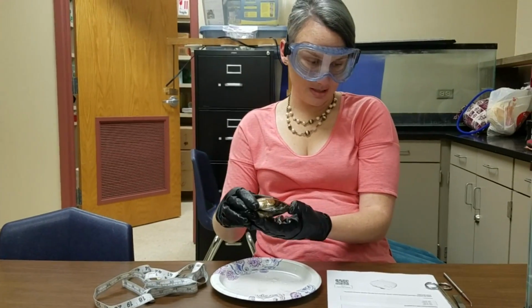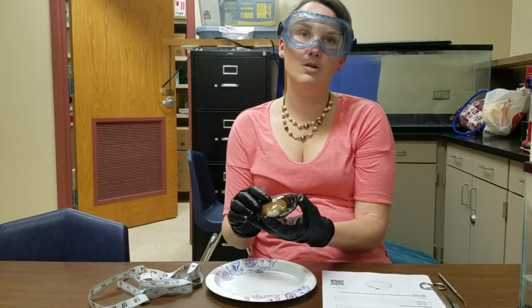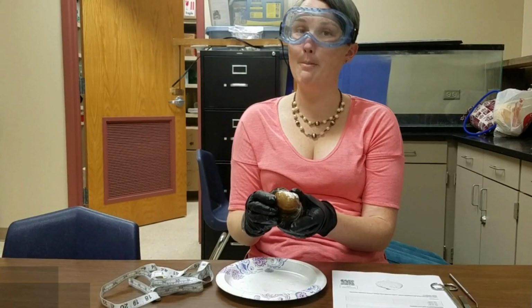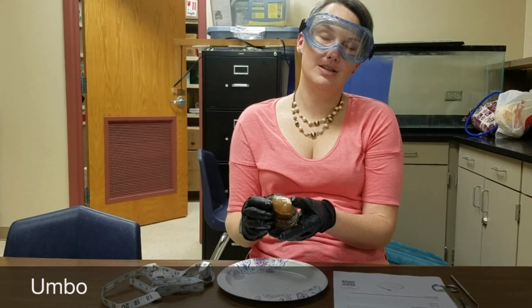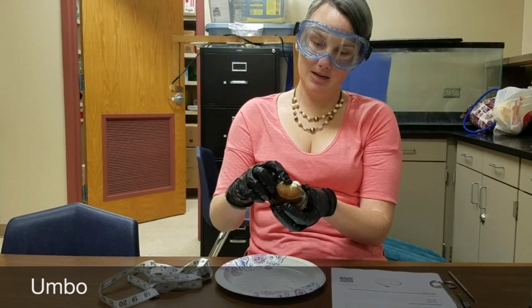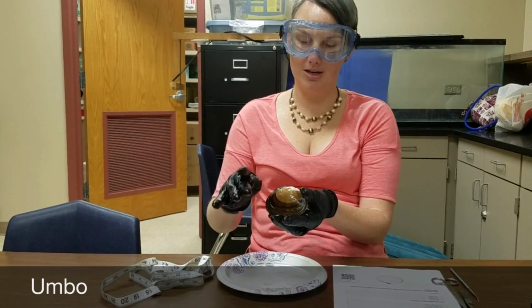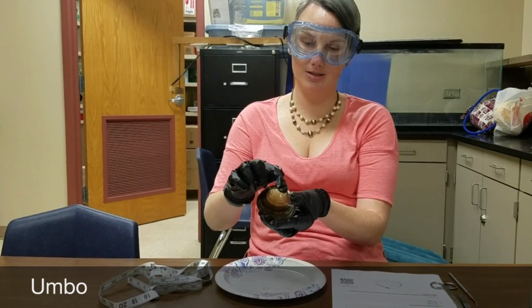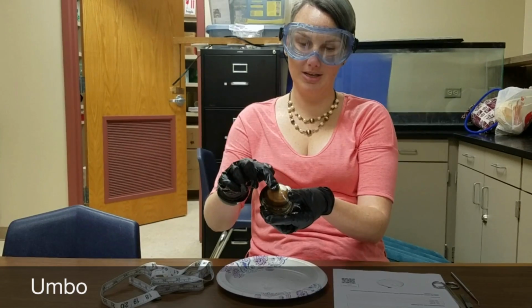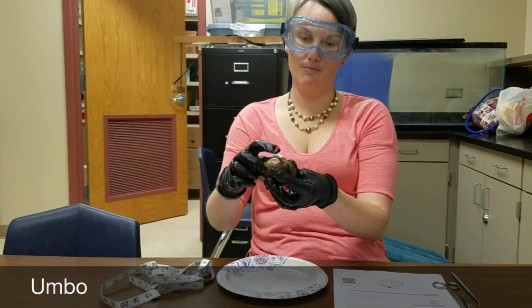Then you're going to label it. You're going to look at the picture and label the following terms, and I'm going to show you where they are on this so that you know what you're looking for. Your first word is umbo, and that's just fun to say, umbo. That is going to be this protuberance. That's a good word too if you ever want to sound real smart. It's this protuberance here, this pokey part, this kind of knob on the top. There are 2 of them, okay? So these are the umbos.